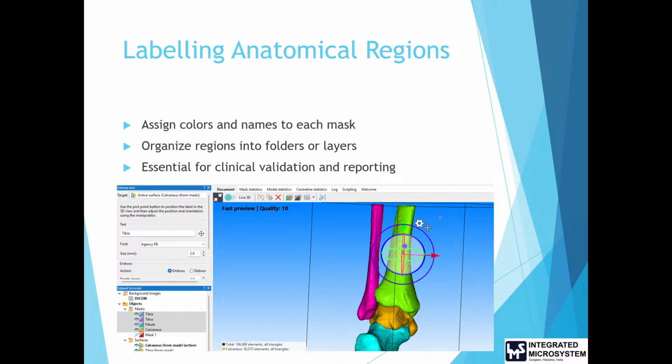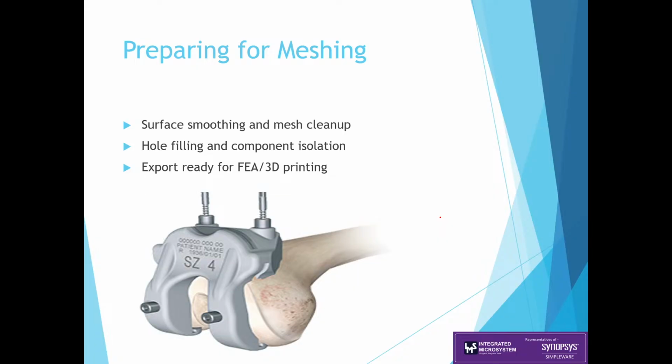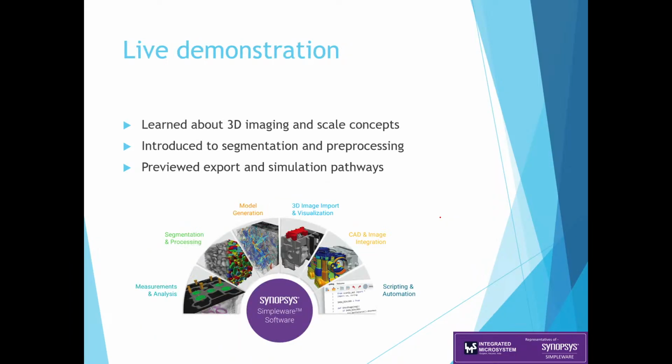We can rotate it and manipulate it in any desired direction. Then whenever we are doing FE modeling, we can mesh it to whichever coarseness is required. We can export that to ANSYS or Abaqus to do the simulation. And once it is done, we can generally produce our results.